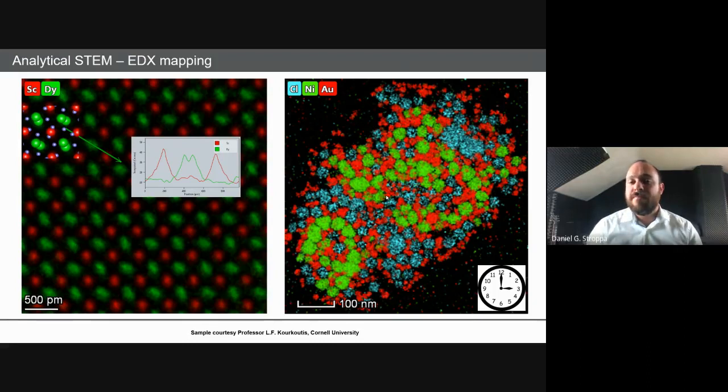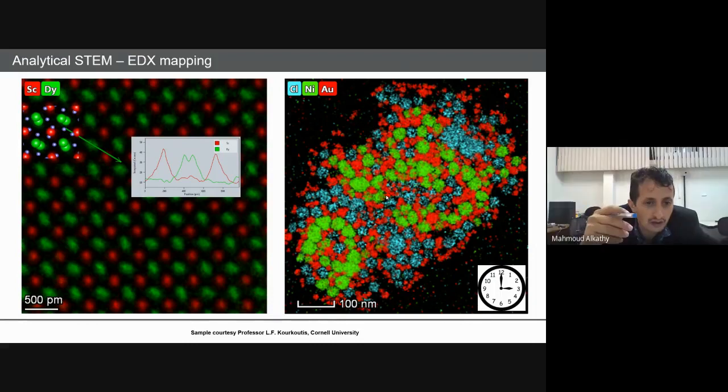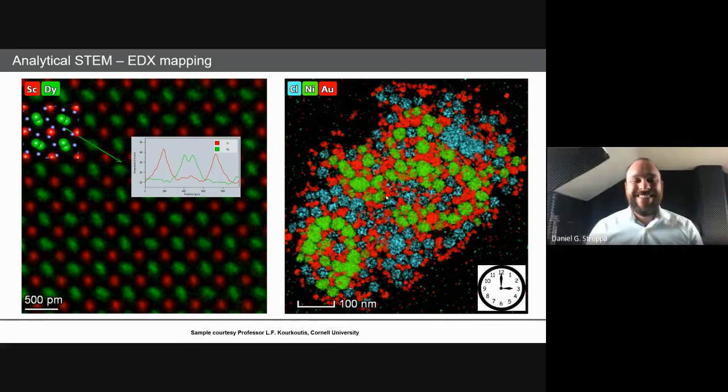That's a good one. Yeah, there are two reasons. One very practical, and the other is on what you expect to get. So imagine that you're going to put a magnetic sample inside a microscope, and it's just inside the objective lens. And at 300 keV and regular excitation, you can get fields in the range of 1 to 2 Tesla. Imagine that you have a magnetic sample there, and you want to move or tilt. Yeah, the sample may just come out of the sample holder and attach to your objective lens. So then you have a problem.